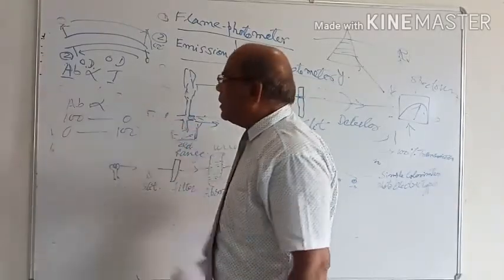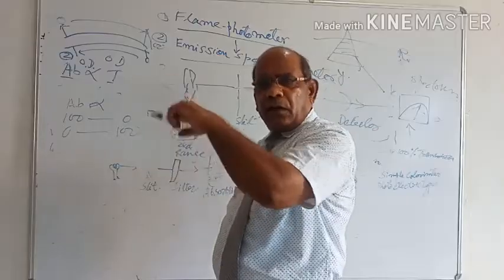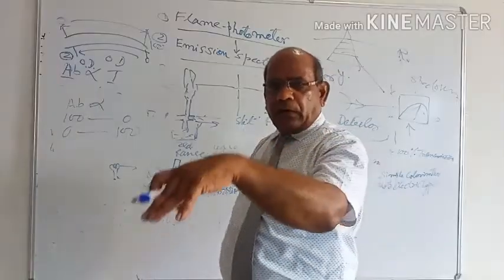So either you may estimate the optical density or you may estimate the transmission. If you take the transmission reading, you have to convert it into optical density.